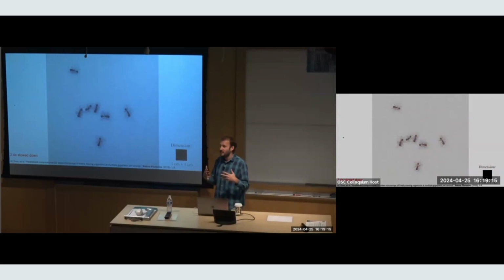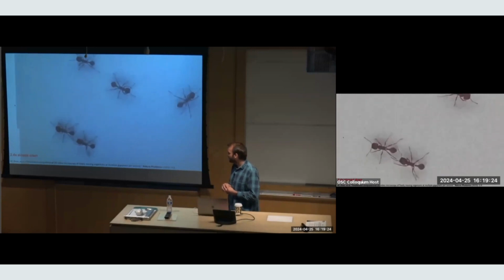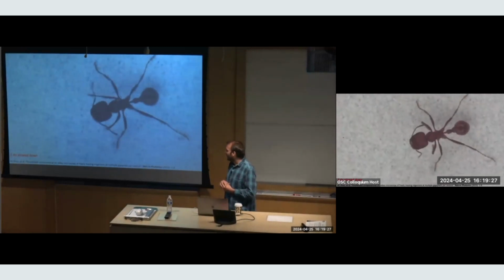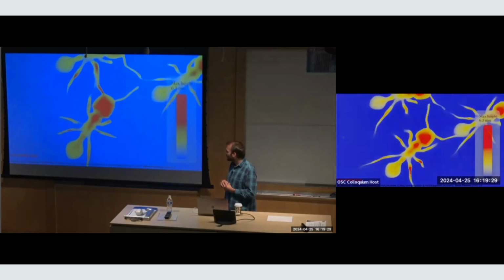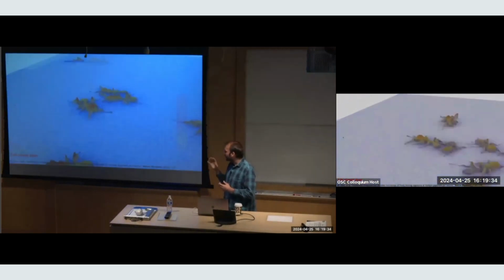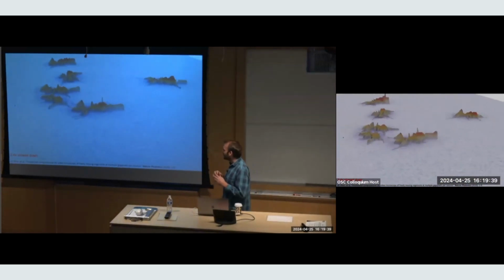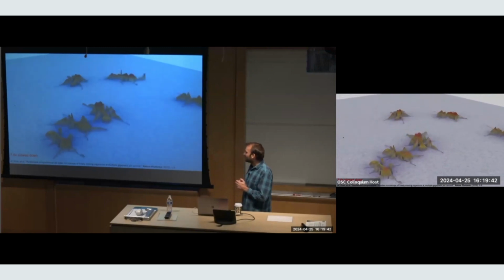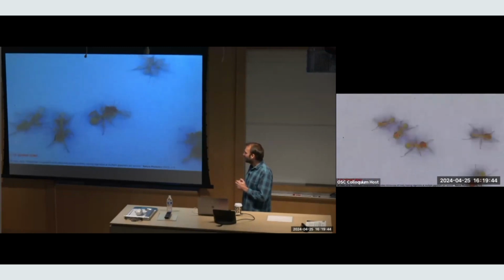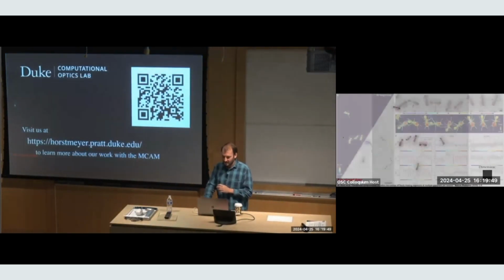So naturally, this is very amenable to video. We just hit play and we're recording all of these frames and we can capture these videos. Here are some ants moving around and you can see we can zoom in and then we show the height map. These are the heights and you can see the error, which is why I love this rendering, that we're not getting them perfectly. But it's still pretty good.